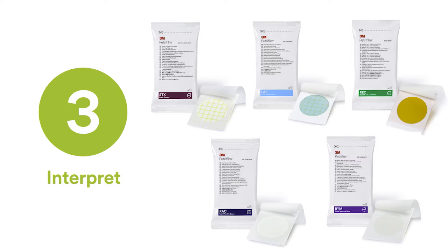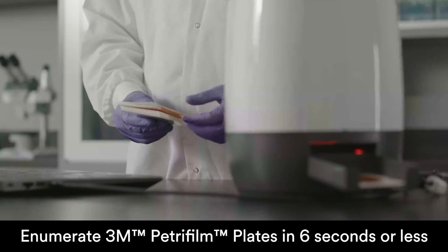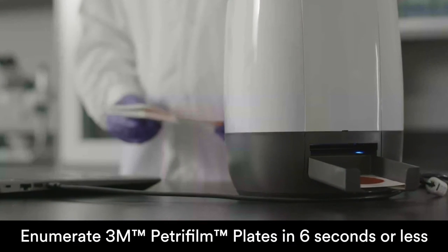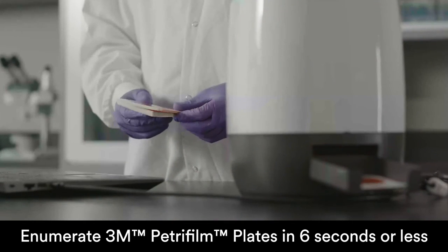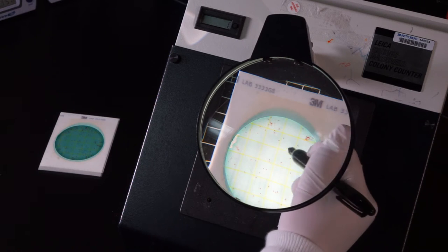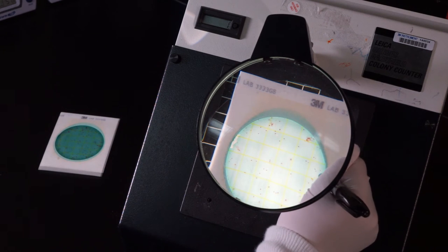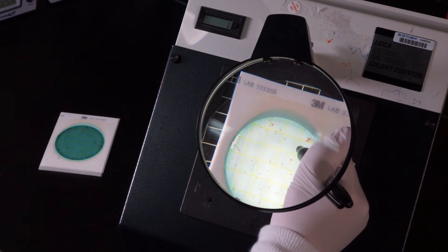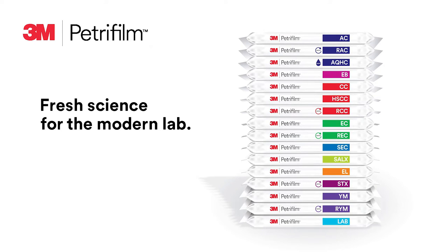Step three: interpret. With the 3M Petrifilm Plate Reader Advanced, your lab's technicians can enumerate 3M Petrifilm plates in six seconds or less while maintaining the accuracy of a trained microbiologist. Or you can manually count colonies using a magnifying glass and hand counter, counter pen, or mark directly on the plate to tally the results.